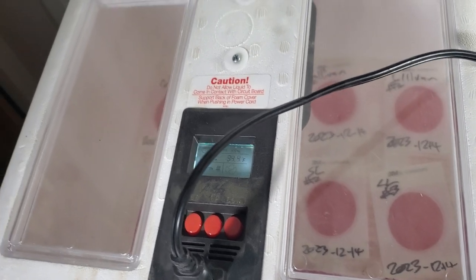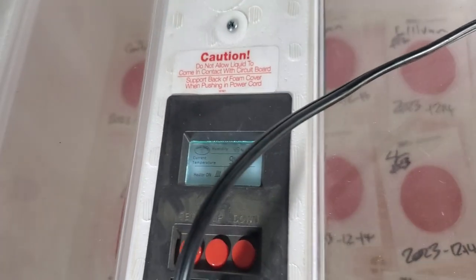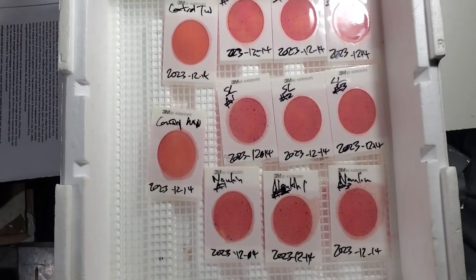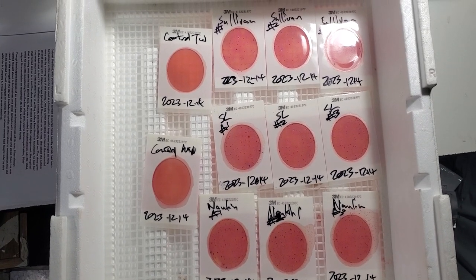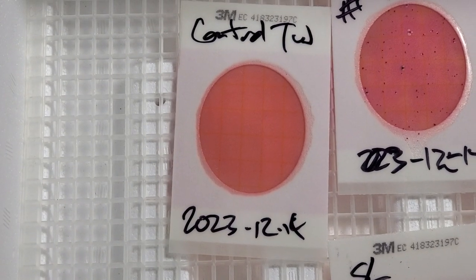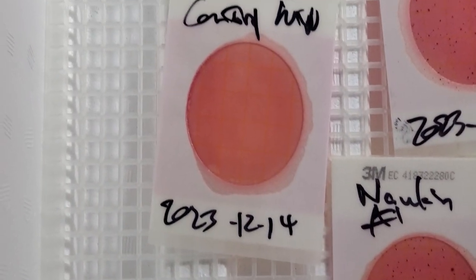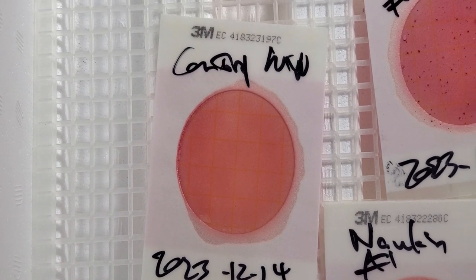One last video for the night. The samples are now in this incubator, where they will stay around 95 degrees Fahrenheit for 24 hours. These are the results after incubating for 24 hours. I actually took two controls: this one here is tap water straight out of my well — completely clean, good. And this one is the same water microwaved for three minutes — also completely clean, one would hope.